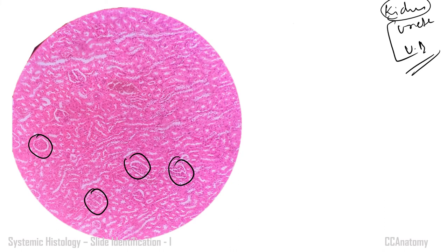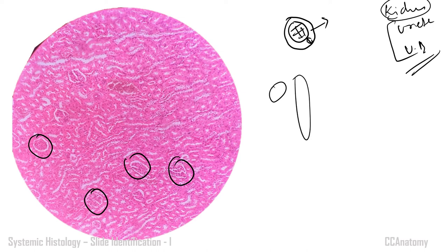The glomeruli appear as circular structures with a central mass surrounded by Bowman's capsule. Between the glomerular tuft and Bowman's capsule, you can make out the urinary space. Wherever the glomerulus is present, you can appreciate the urinary space clearly. Apart from that, you will see multiple cross-sections or longitudinal sections of proximal convoluted tubules (PCT) and distal convoluted tubules (DCT). With the presence of glomeruli along with the urinary space, you can clearly identify the slide of kidney.